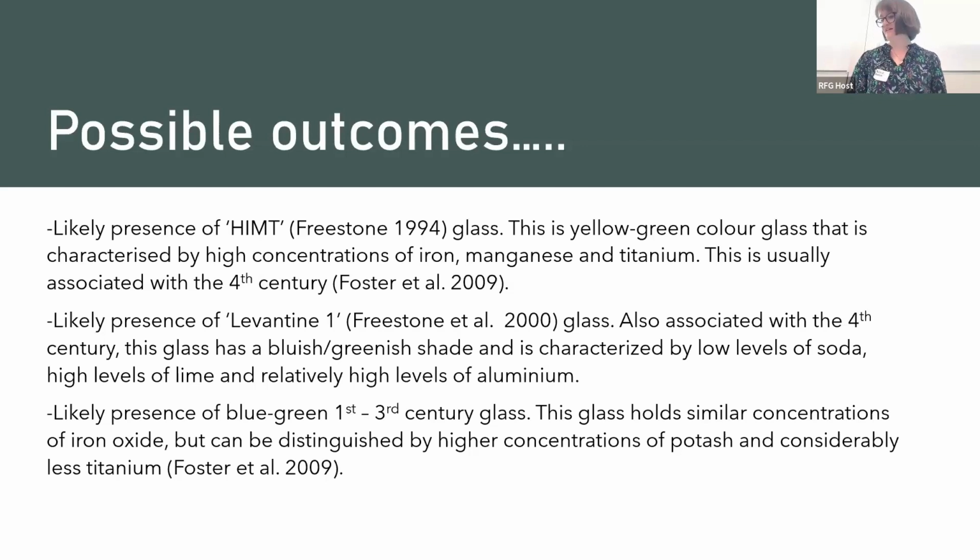So, whilst this study is unlikely to unearth any startling new discoveries regarding Romano-British glass production and consumption, my apologies, everyone, terribly sorry, I will be interested to see if there's any improvement in the accuracy of results with the background noise through the new pre-treatment analysis, which I have been outlining in this talk, in comparison with other glass analysis projects, such as Sarah Painter's 2006 study of the colourless glass from the previous round of excavations at Binchester. This study will form a very small part in the much larger pantheon of Romano-British glass analysis.